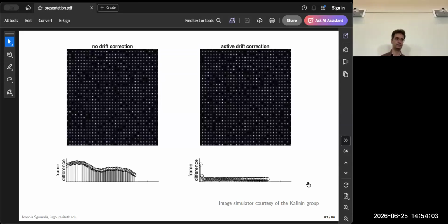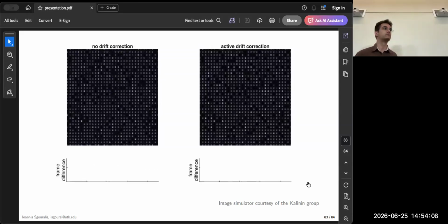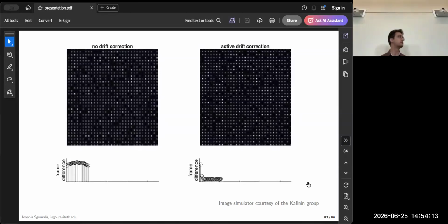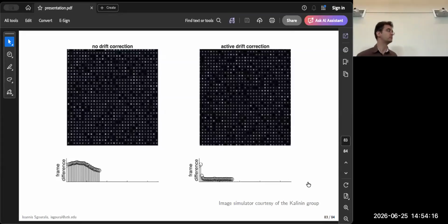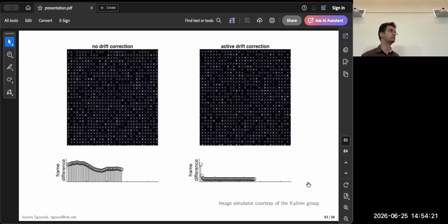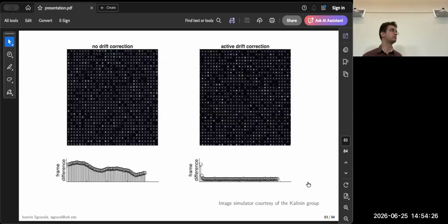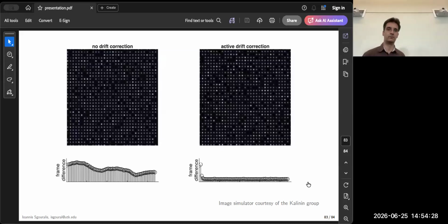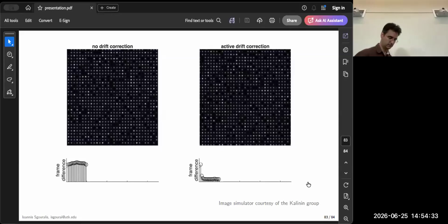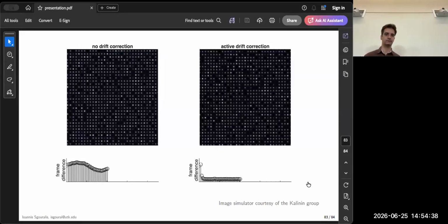Okay, very good. I think there's a big potential here because we want to place the beam, of course, at a random position when we do our analysis. So we need to know where the sample is at that time, right? So that's where this comes in. We did that yesterday, place the beam somewhere, and we learned how to do that in machine learning. Of course, we want to hit the location exactly, independent of drift. Right? So that's where the drift correction matters.